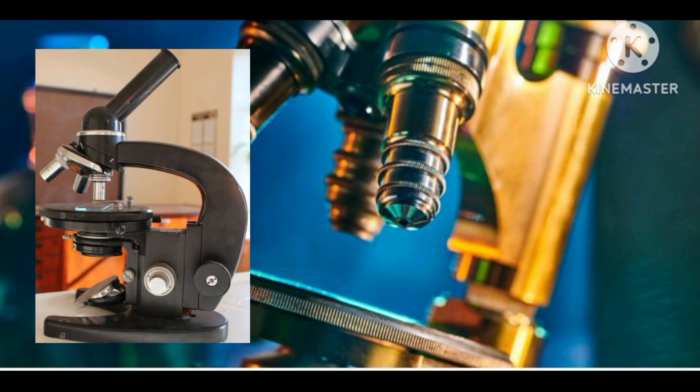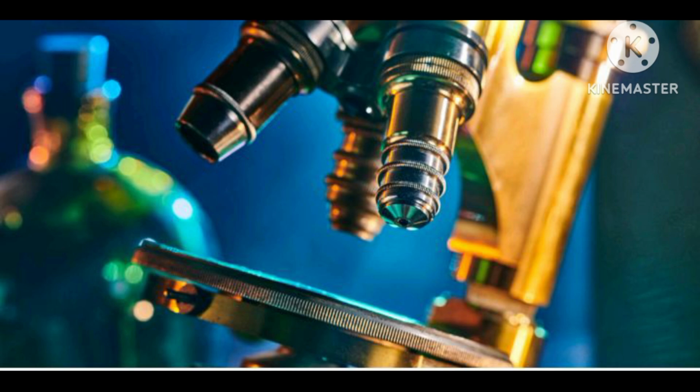These parts include eyepiece, eyepiece tube, diopter adjustment, nosepiece, objective lenses, the adjustment knobs, fine adjustment knob, coarse adjustment knob, stage, stage control knobs, aperture, microscopic illuminator, condenser, diaphragm, condenser focus knob, Abbe condenser, the rack stop, light switch, brightness adjustment, etc.